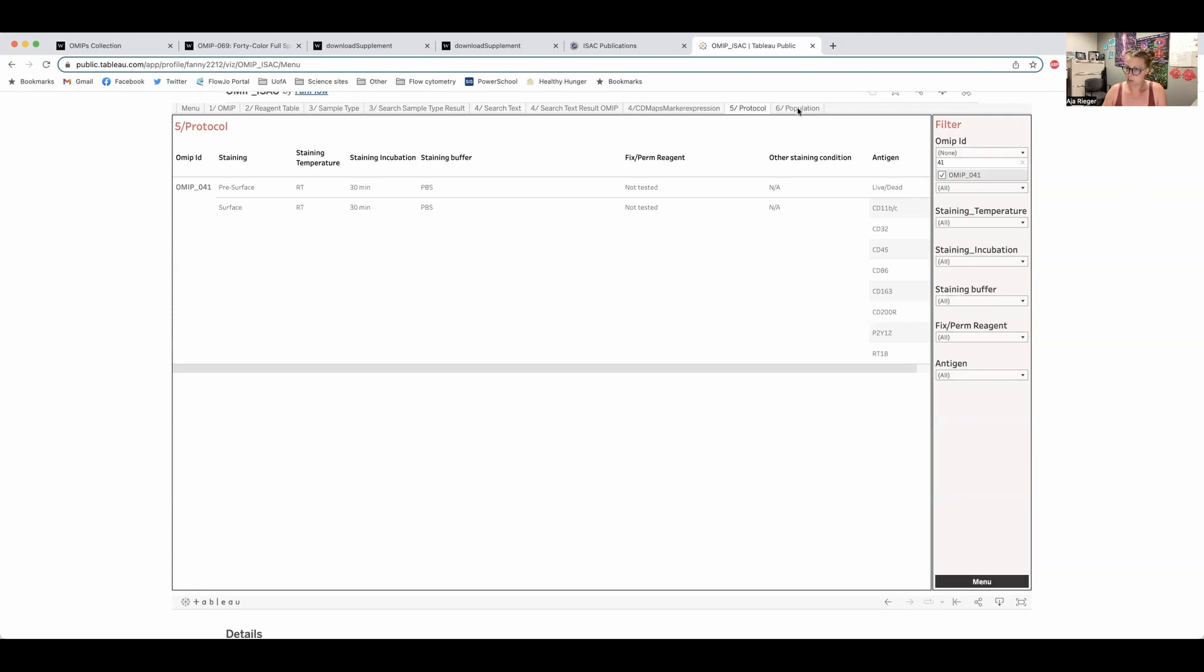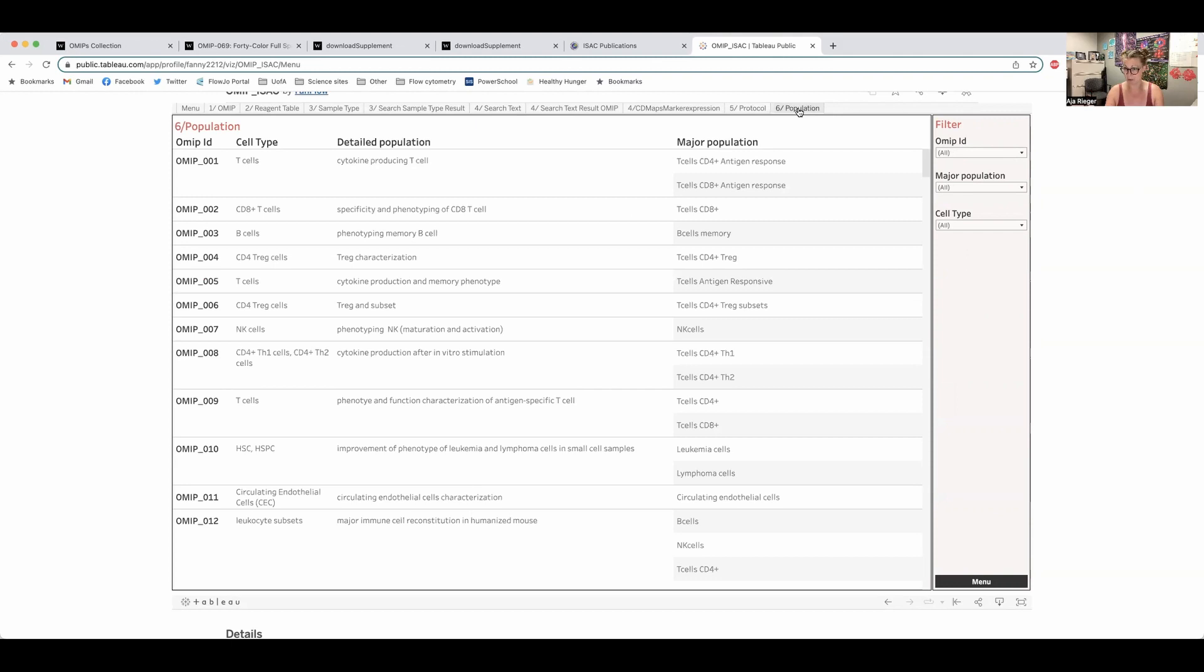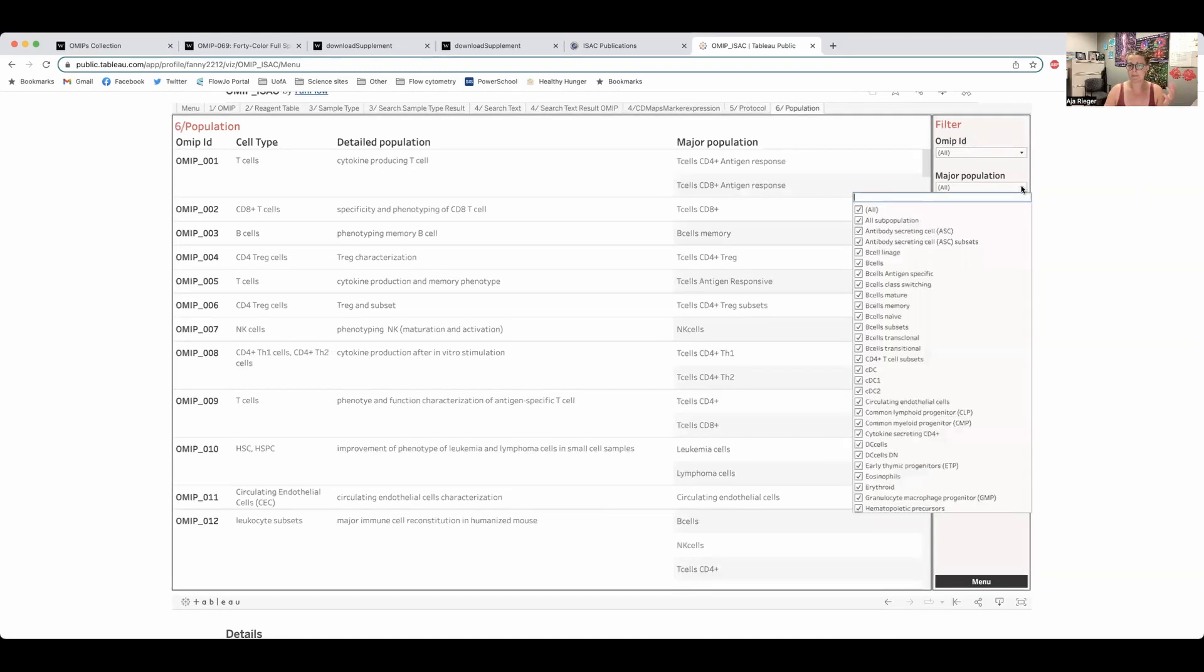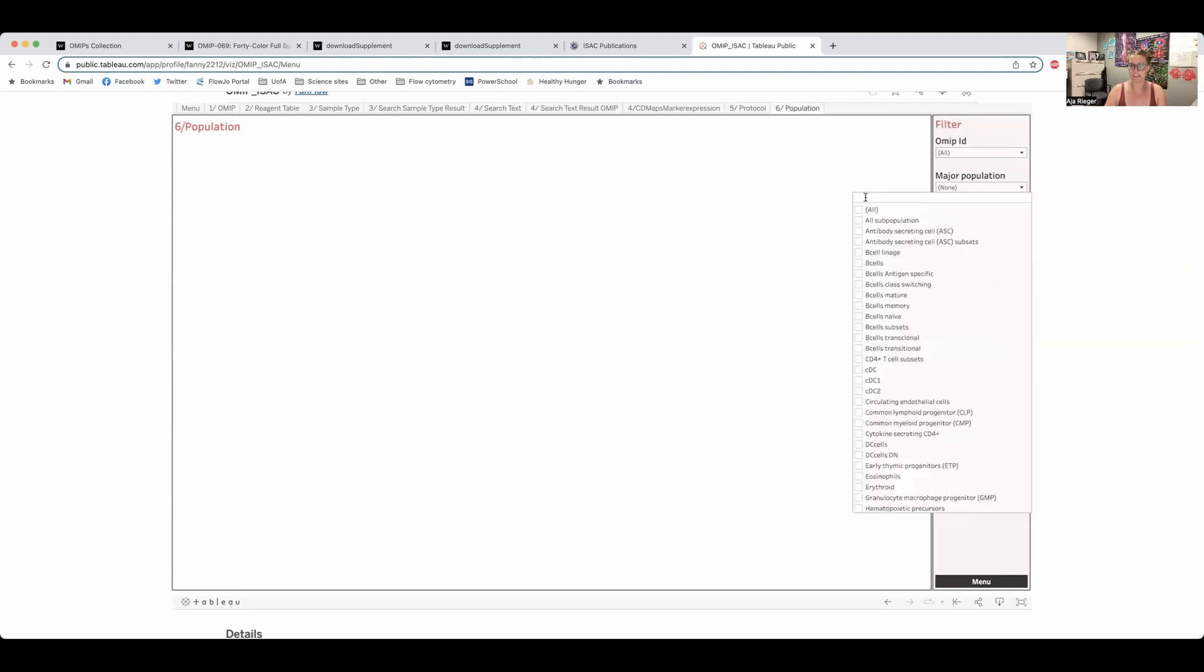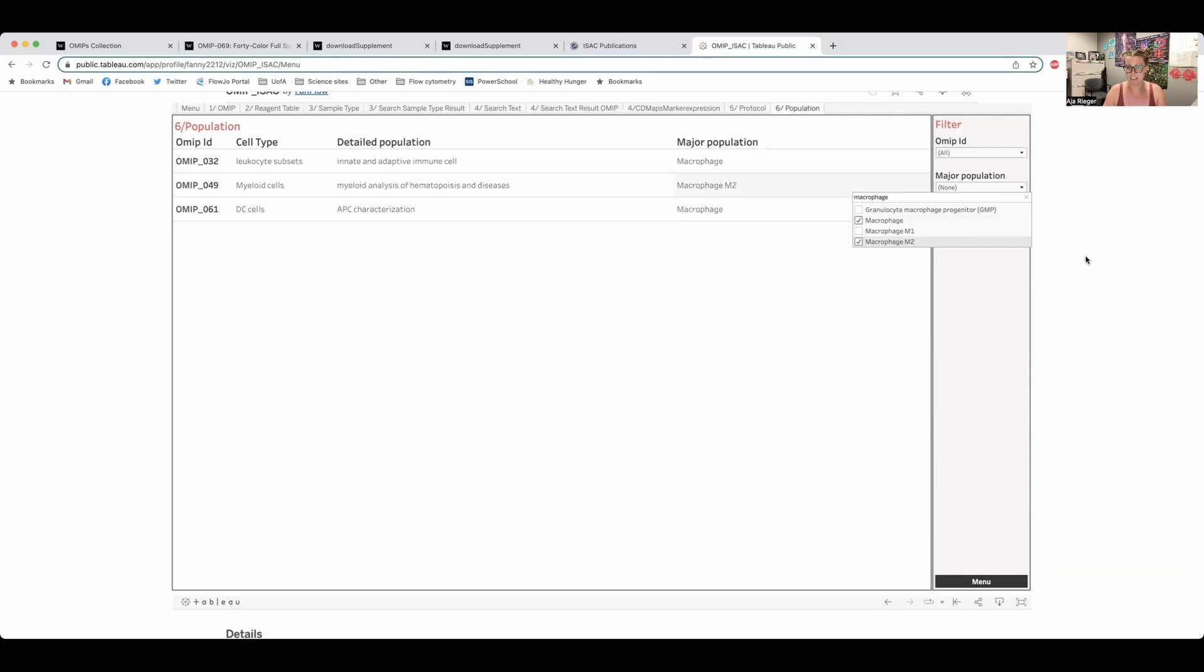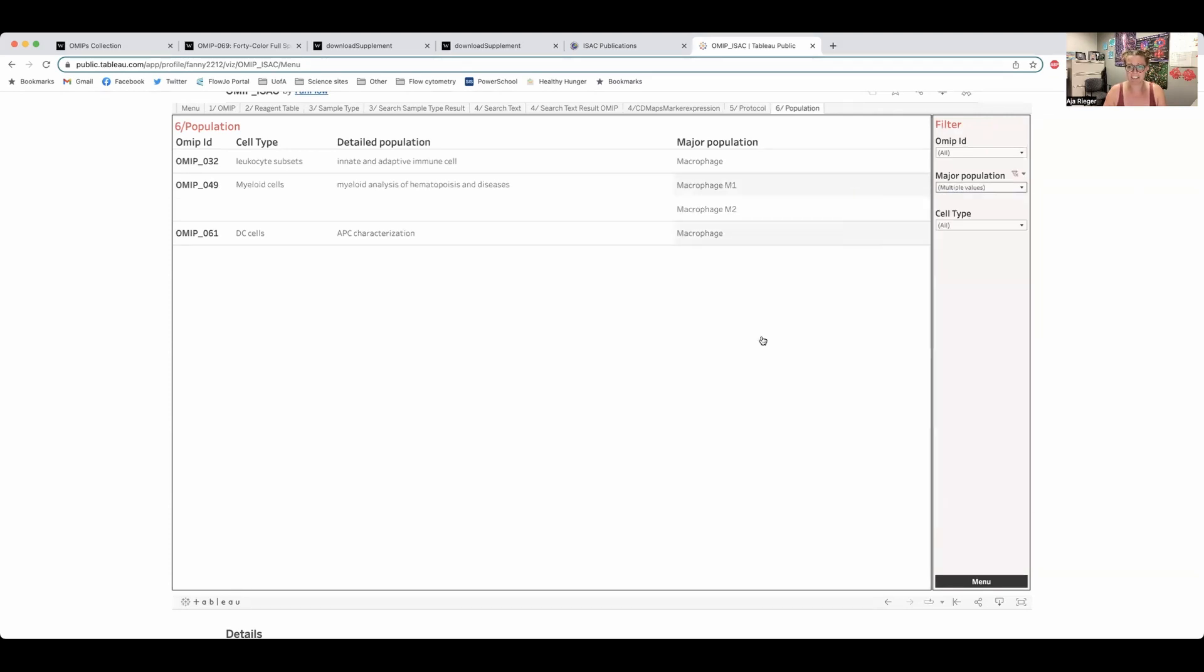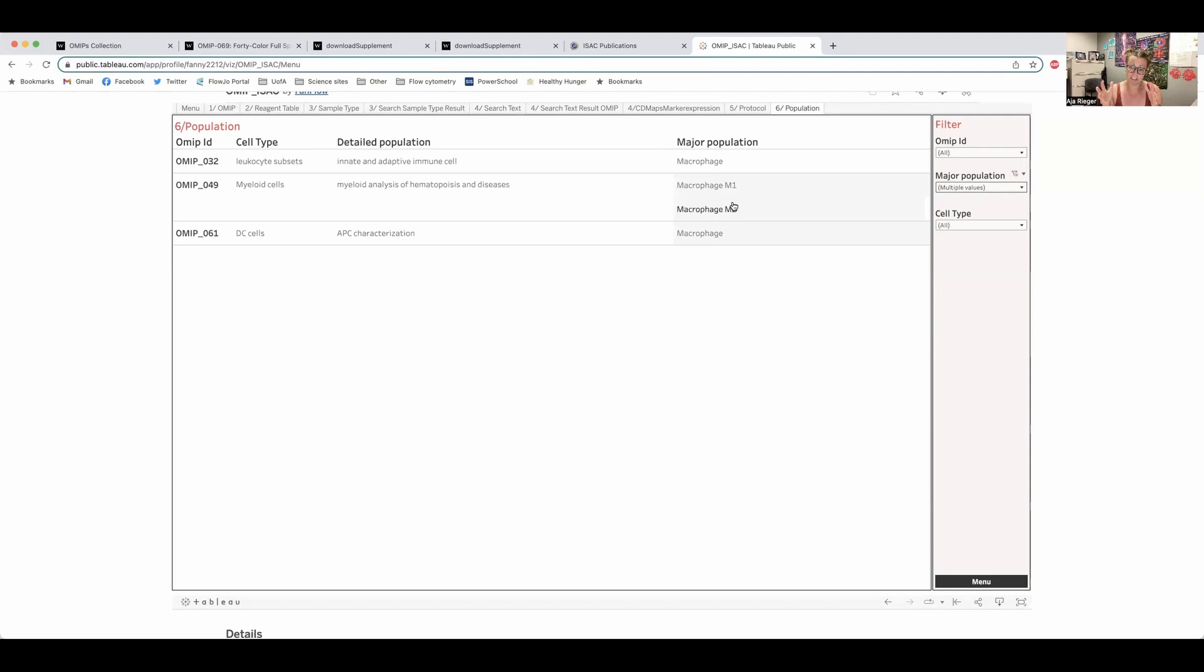And the part that I find really cool is this population tab. So if you're looking to classify a certain type of cells and not sure which OMIP you should be looking at and you don't want to dig through the whole list, this is the place I would recommend you start. So say for example, I want to study macrophages. I can go in here and type in macrophage and select it on the list. And if I want M1 and M2, I can check those off as well. And over here, you can now see these are the OMIPs that specifically list that they work with macrophages or M1 and M2 macrophages as major populations. So if I then wanted to study these or take some work out of making my panel, I can go look at these OMIPs and use that to create my panel.